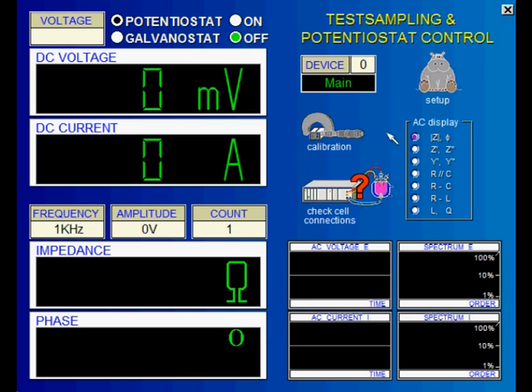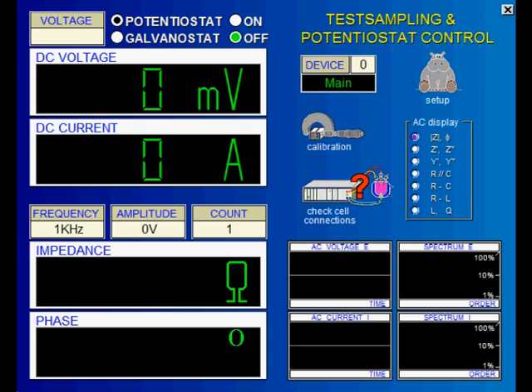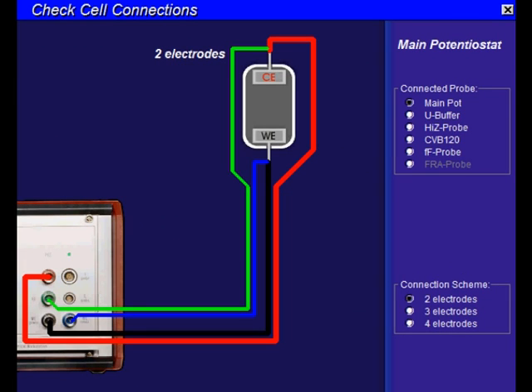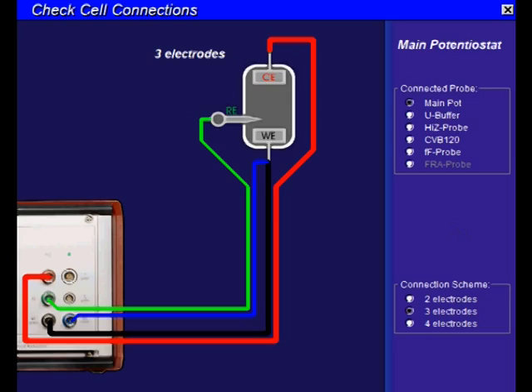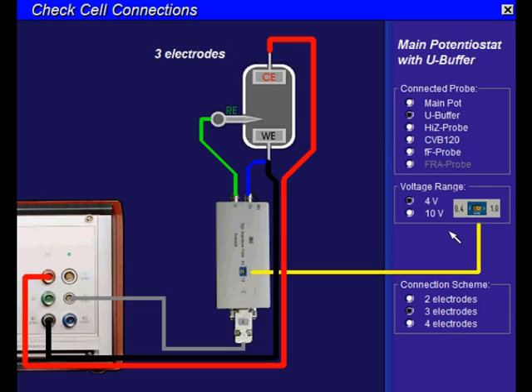Let's have a look at the check cell connections page now. Here you define whether you are using a 2, 3, or 4 electrode arrangement. In addition, you have to specify the use of a buffer such as the U-buffer or the HiZ probe, and you have to enter the gain switch setting here.